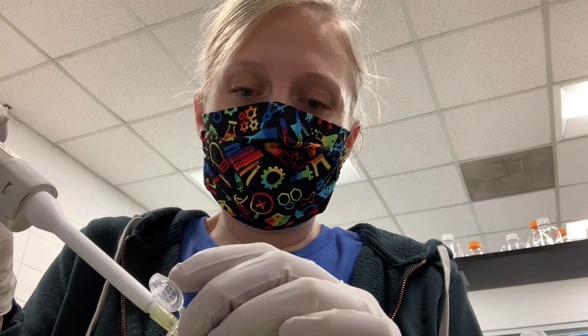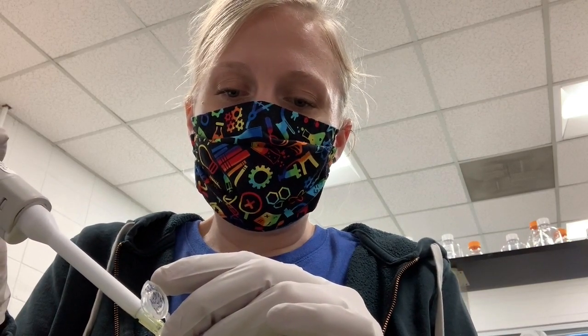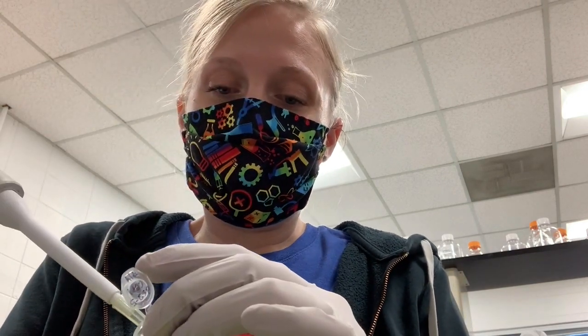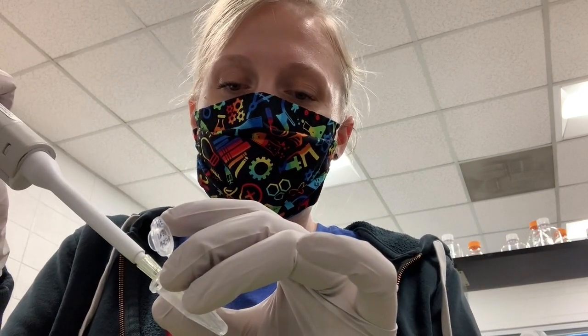You are going to leave these tubes open once you've removed the supernatant. And the reason you're going to do that is we're going to just leave them on our bench top for 5 minutes and allow these pellets to dry. This will allow any excess ethanol to evaporate. And ethanol can interfere with downstream applications. It can cause problems if you try to feed double-stranded RNA that had too much ethanol in it, and so on. So we always want to just make sure these pellets are completely dry.